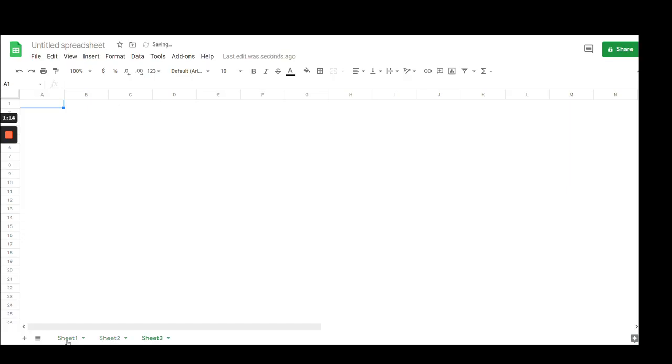First of all, I would recommend 3 tabs. Double-click to rename. The first one's going to be your site. In the data section, we're going to say, okay, these are the machine names and types of errors.